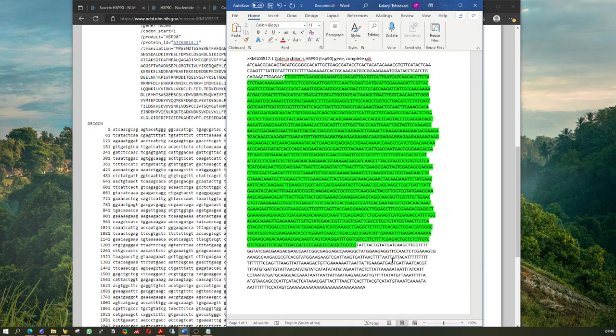The length of the primer, you need to have between 18 to 20, it varies, some people say 15 to 24, but I think you get the picture. 18 to 20 base pair sequences is really good, and you need to choose a very good melting temperature, I think probably above 55, and your GC content should be between 40 and 60. You understand why we care about the GC content to begin with: GC content is all about the strong hydrogen bonds that we want to melt when we're opening and closing the strand during amplification.